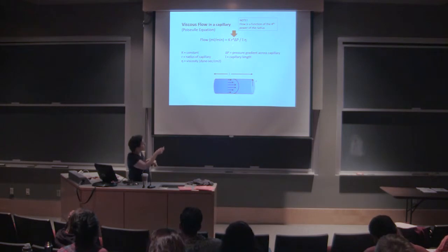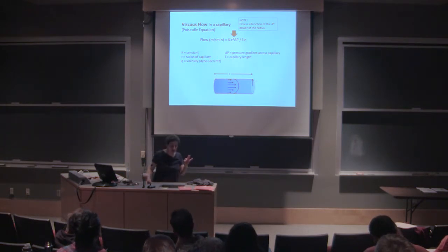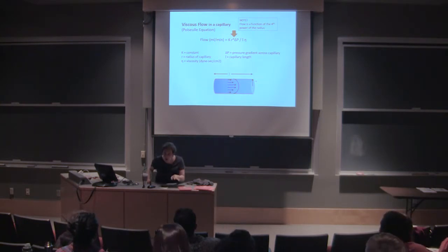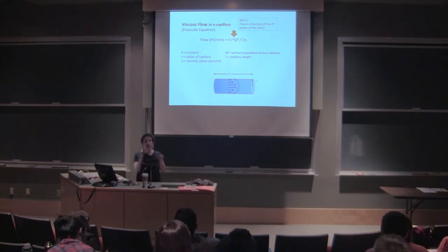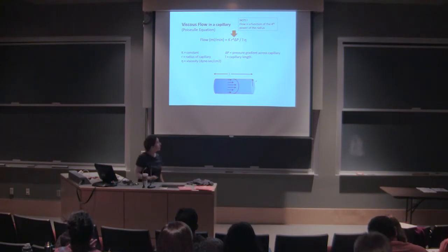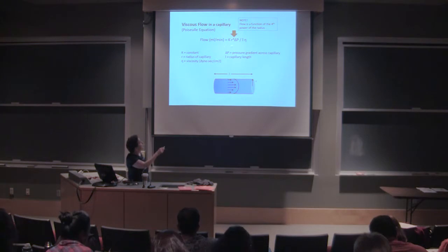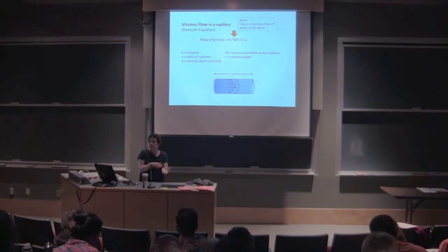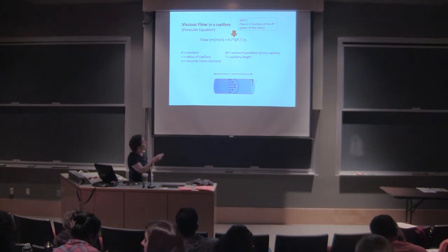What's really important to note here is that the flow is a function of the radius to the fourth power. Say that with me now. Radius to the fourth power, right? So if you swap out a tube that's slightly bigger or smaller, thinking it won't matter, it will matter. So that's something to pay attention to when you're working with these systems. You can actually use the diameter of the tubes as a resistor, as a way to slow flow down if you want to. It's a very powerful sort of understanding to have.